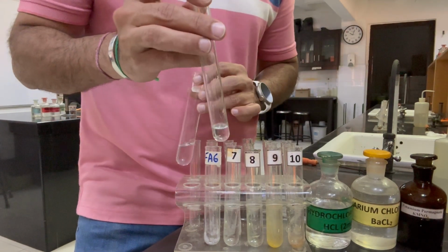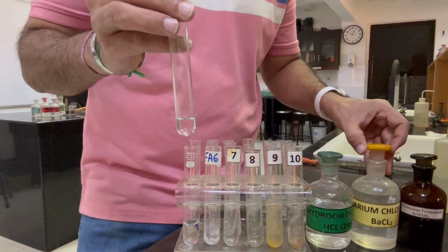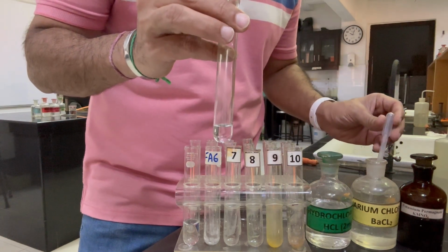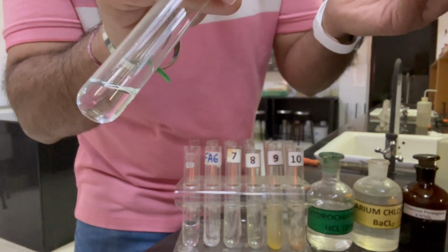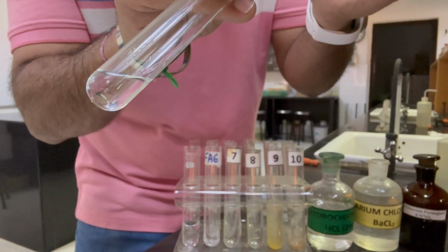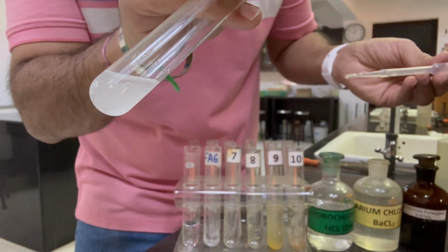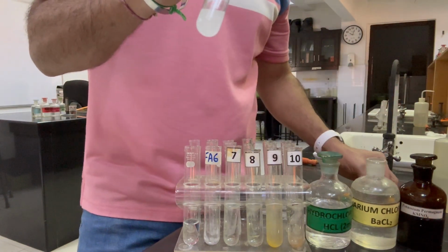This is 1 cm depth of solution Fa6, and now we will add a few drops of barium chloride. As soon as we add a few drops of barium chloride, white precipitates are formed.